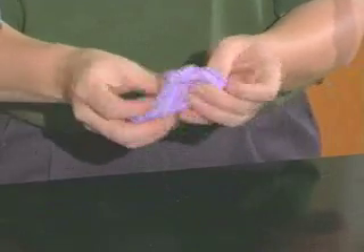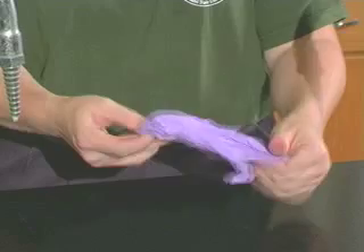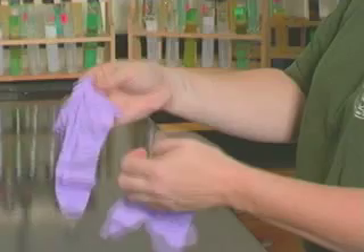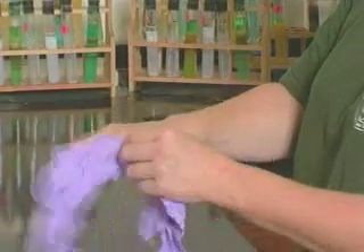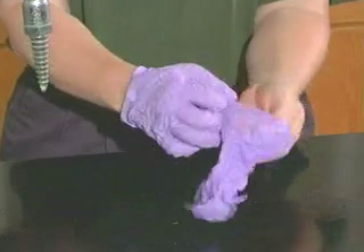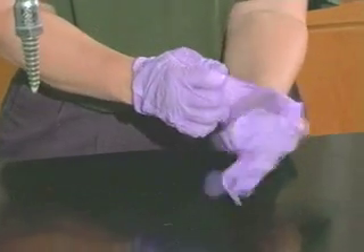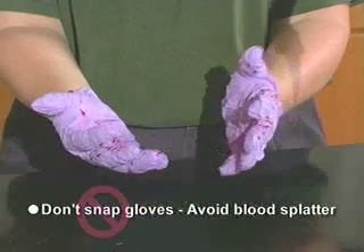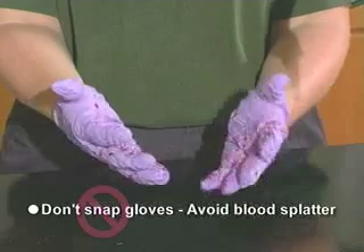You should always use disposable single-use gloves to protect your hands from blood-borne pathogens and other potentially infectious materials. When taking off contaminated gloves, do it carefully. Don't snap them — this may cause blood to splatter.